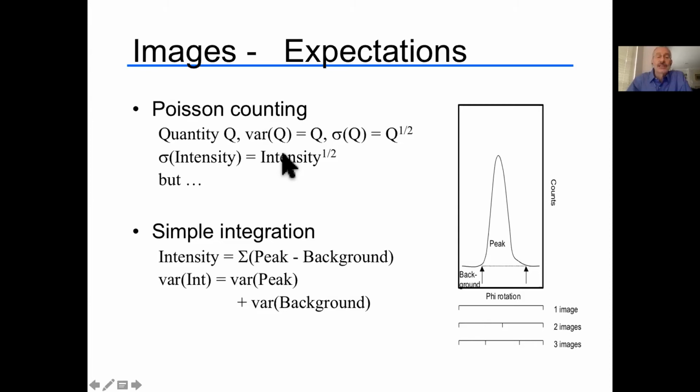But integration is not just measuring the intensity. Let's call this a one-dimensional experiment, where as we move along in this dimension, the peak enters, or the Bragg reflection, or the reciprocal lattice point, passes through the Ewald sphere, either from the outside to the inside or from the inside to the outside. We get constructive interference, Bragg's law will hold, and then it diminishes as Bragg's law shows.